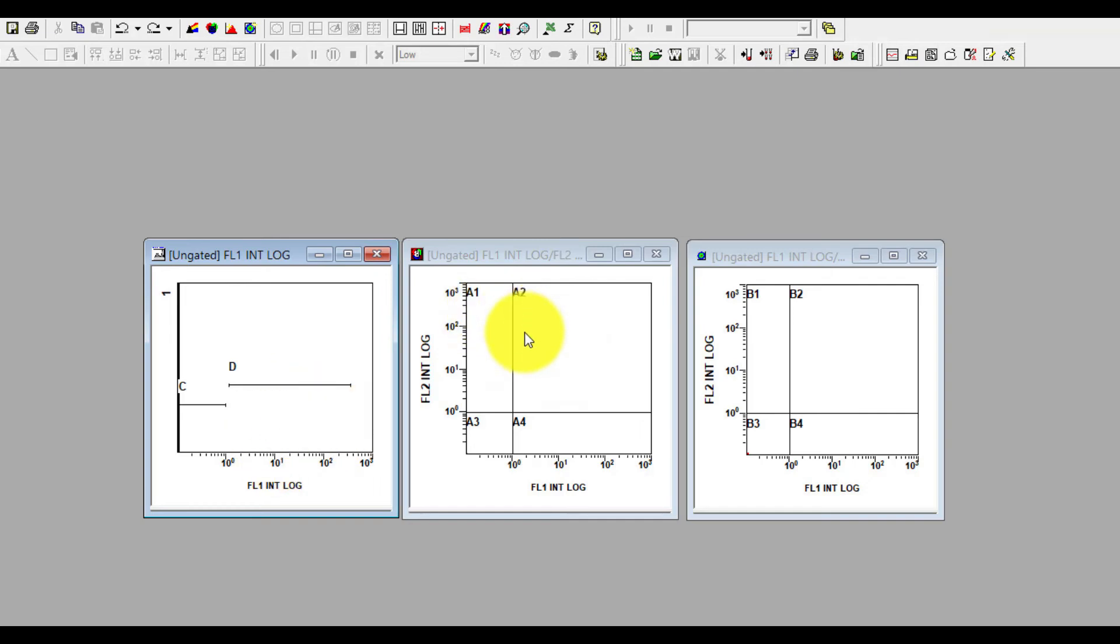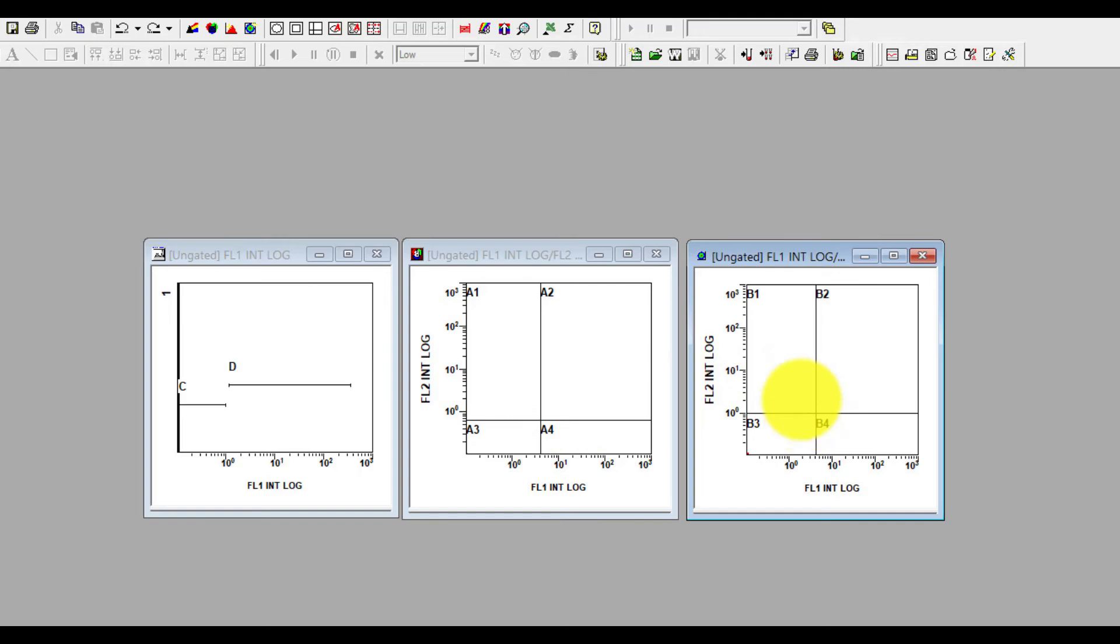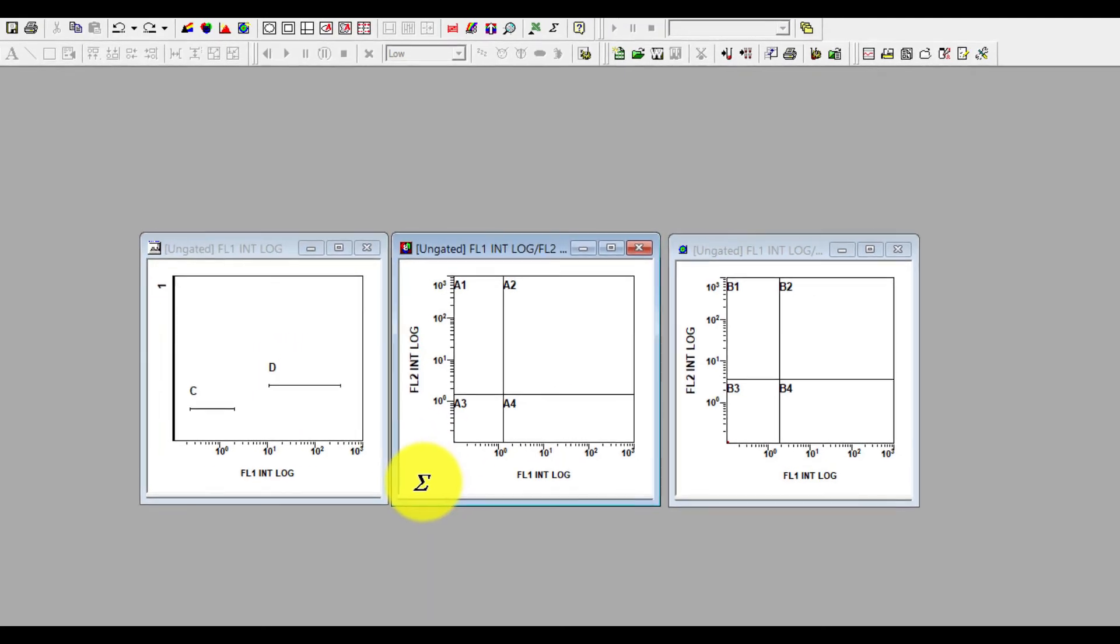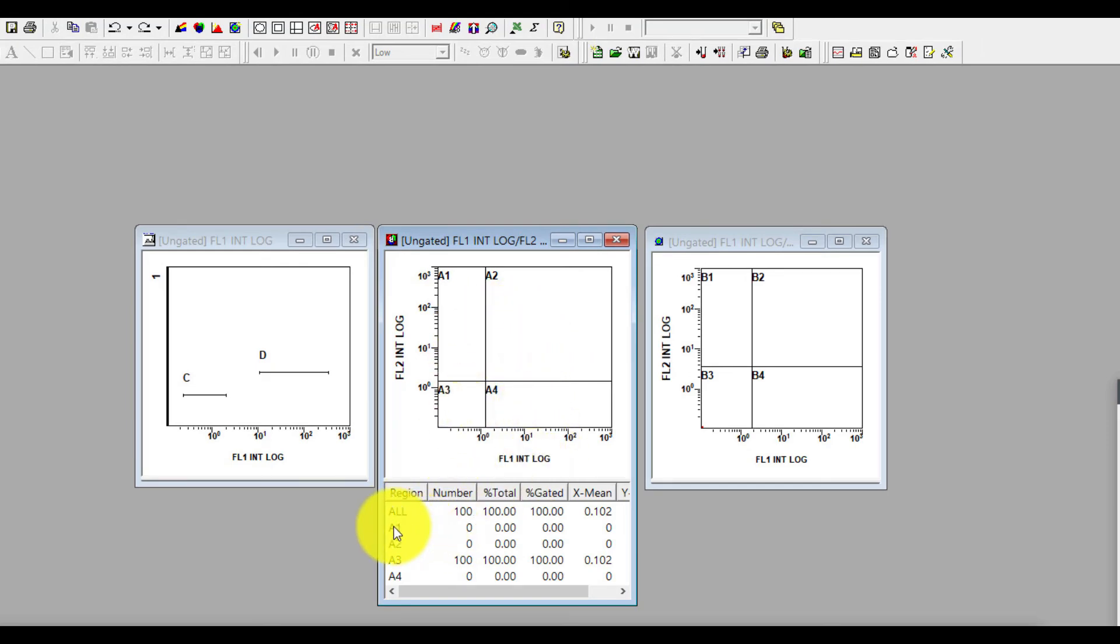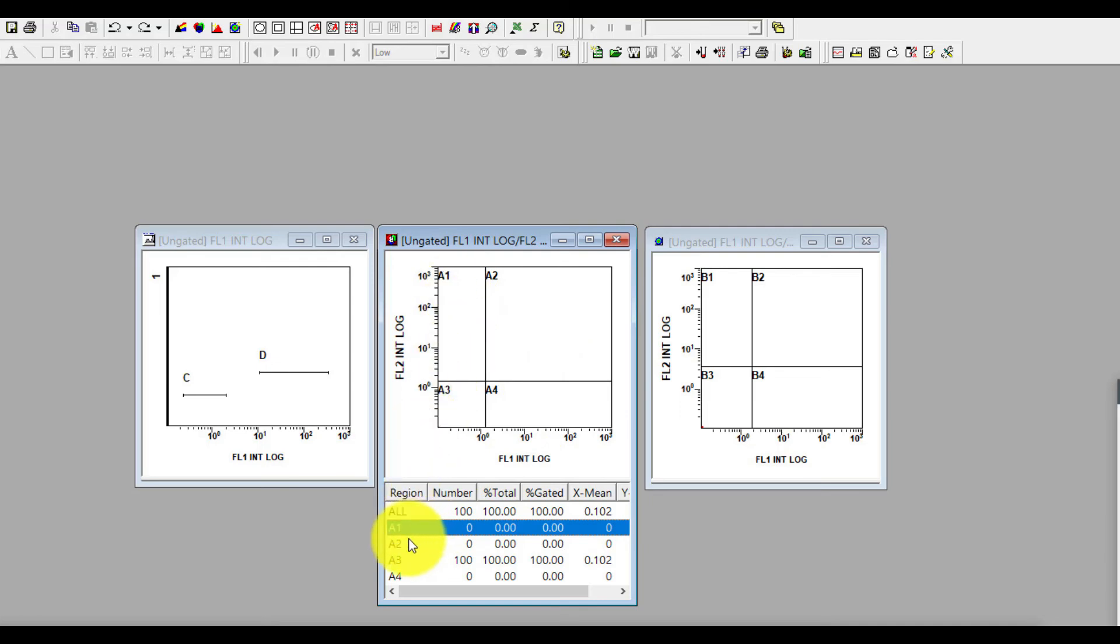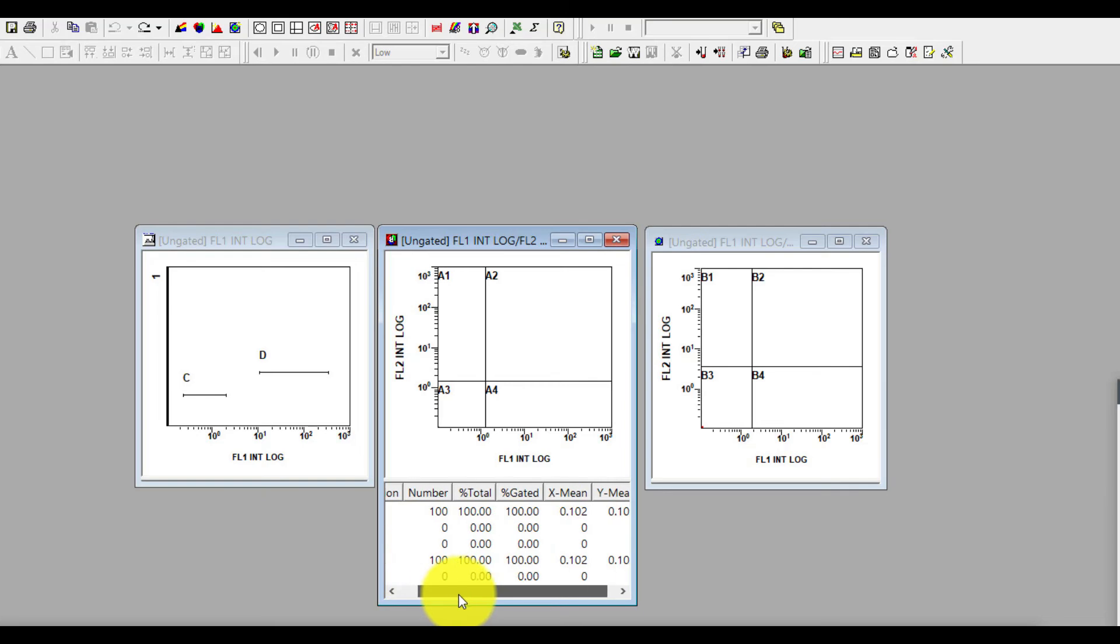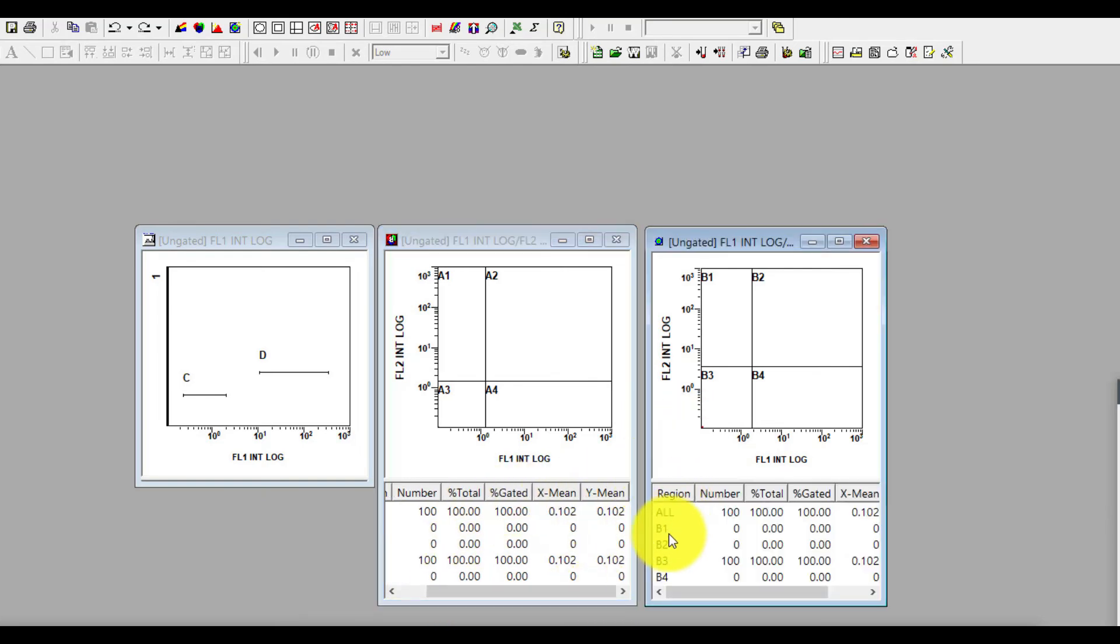You can also adjust the position of the quadrant according to your cell population, which you will later see how I adjust it. And also you can adjust the linear regions in your histogram plot according to the population by clicking this icon. Once you move the mouse you can see all the regions are appearing: A1, A2, A3, A4, and there are all the x mean, y mean, percentage per total, per gated, total number appearing. Same with the density plot and also same with the histogram plot.